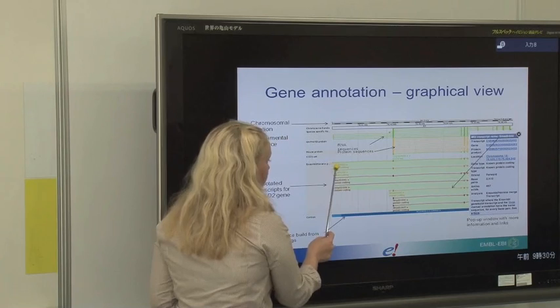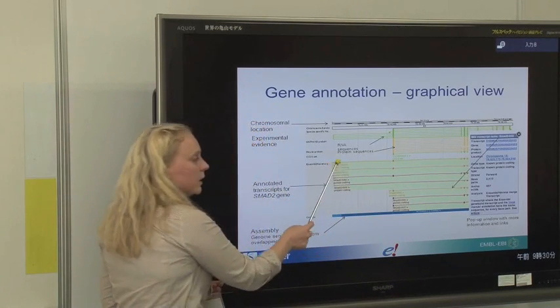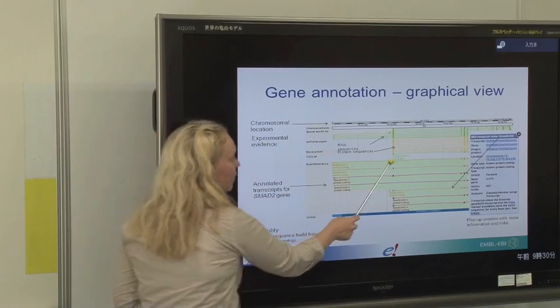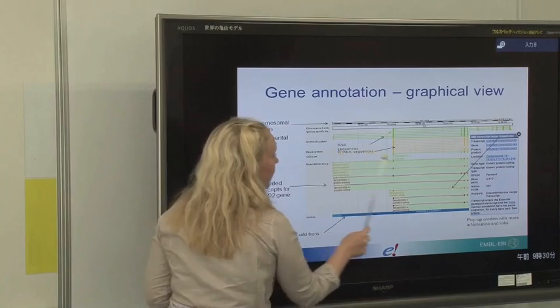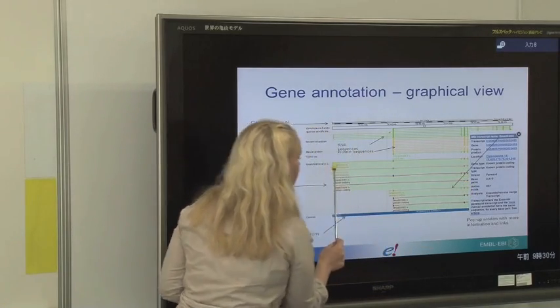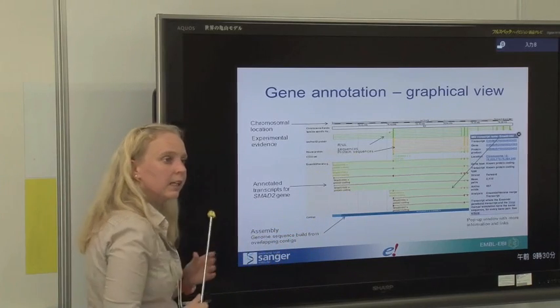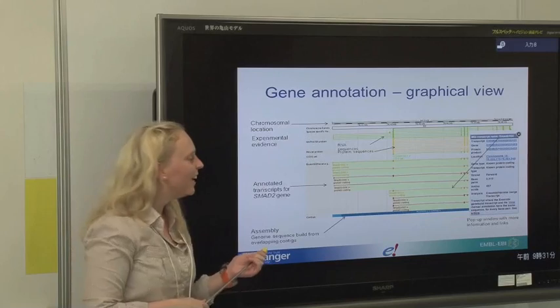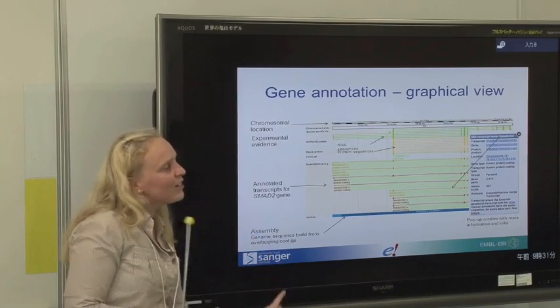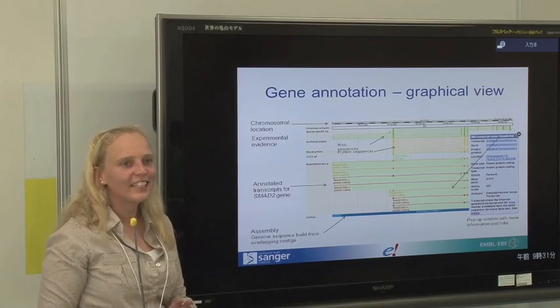If the boxes are unfilled, anyone would know what this actually means, the unfilled or filled. You can see that we have several exons here, but some at the start and sometimes at the end are unfilled. Would you know what's the difference between filled and unfilled exon? So, as I said, it's only at the start or end. It will never happen in the middle.